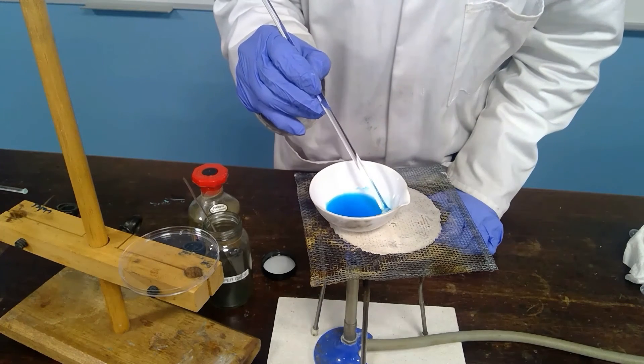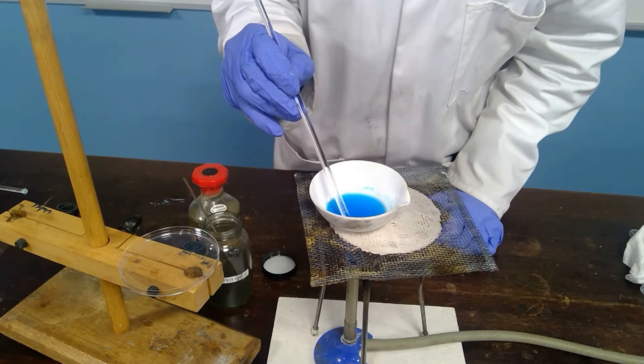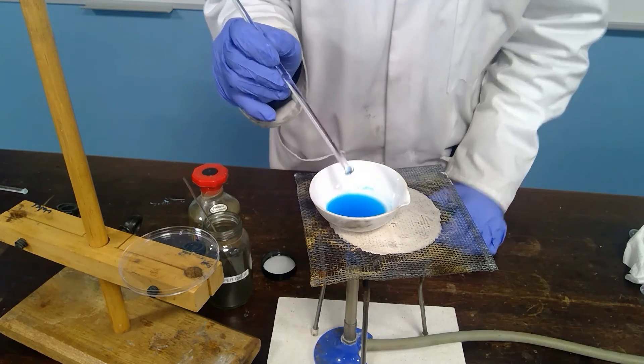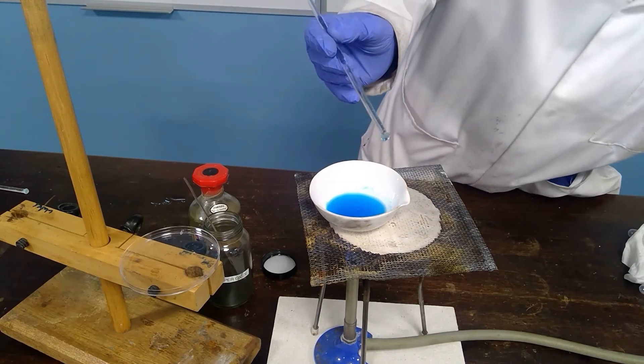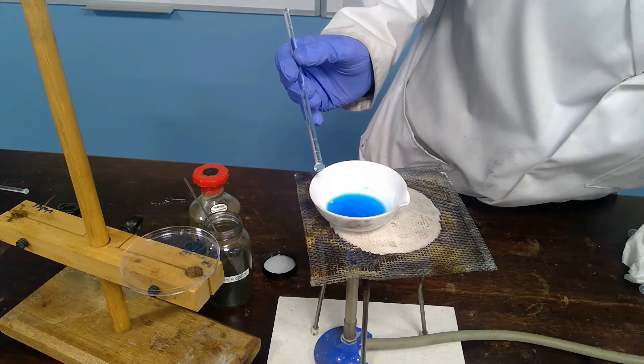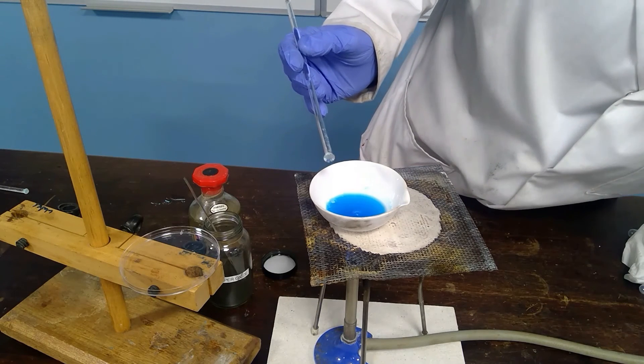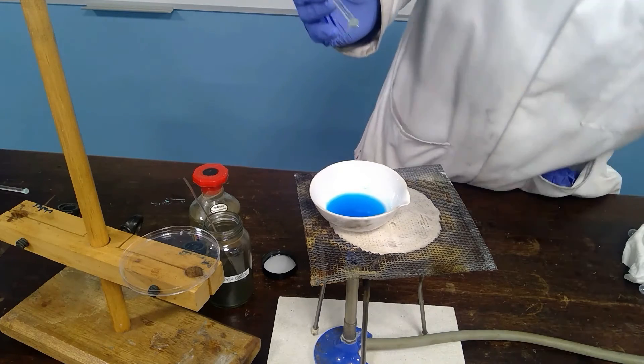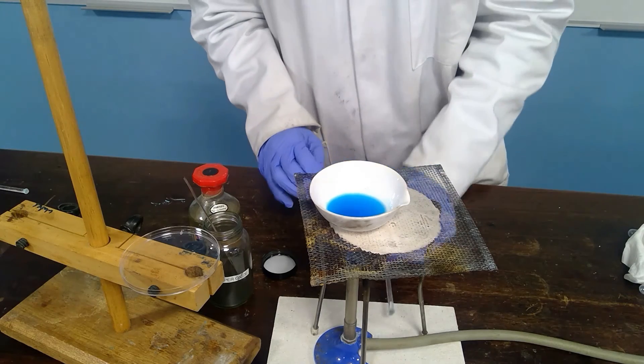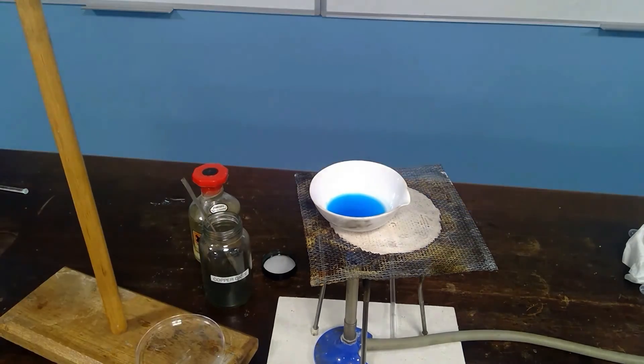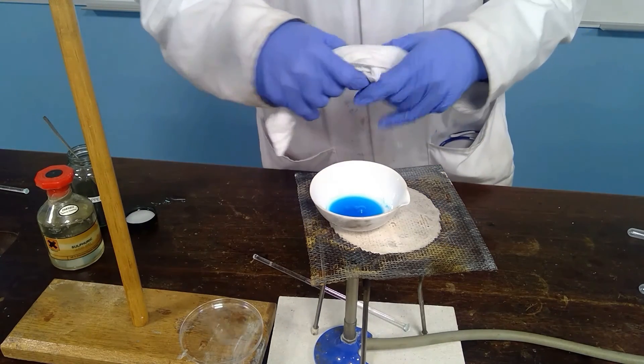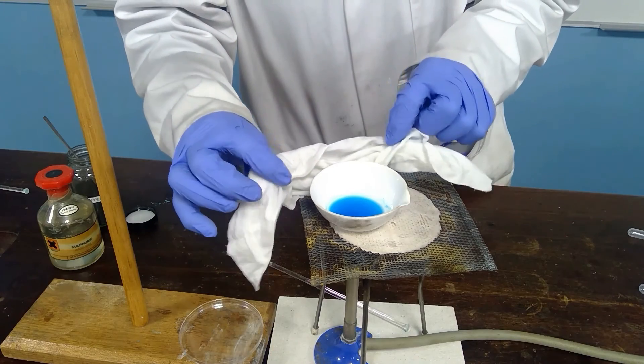As you can see around the edges, there's some signs of both blue but also definitely some white or near white anhydrous copper sulfate. So we've got it boiling now so I will again turn the Bunsen down to very low heat and just allow that to boil for a few minutes. So at this point we will transfer across to the petri dish.